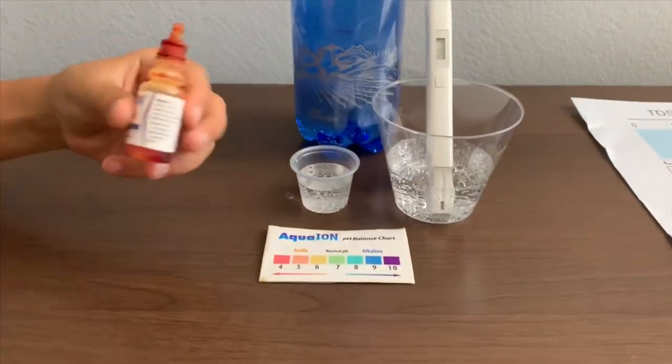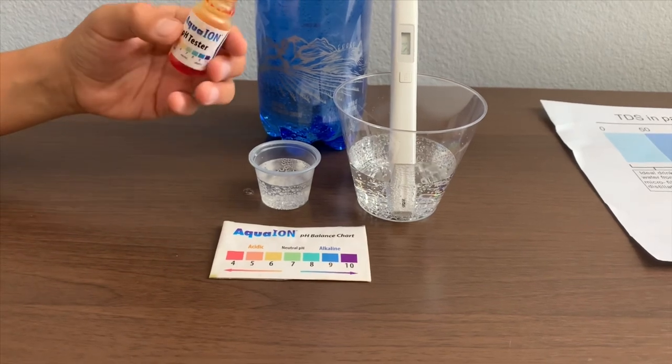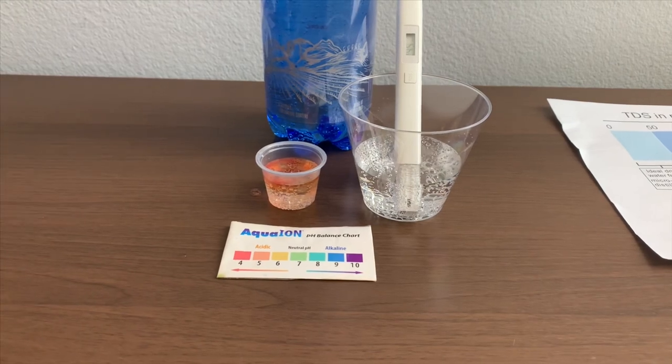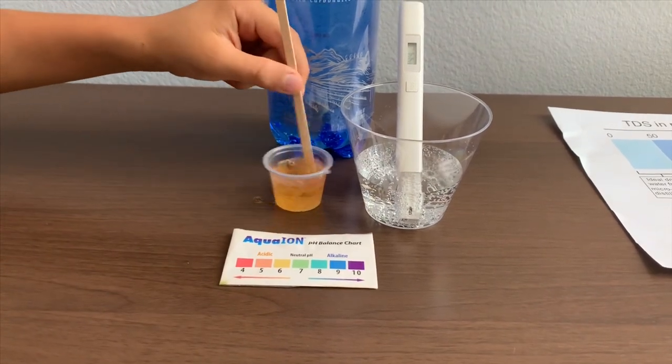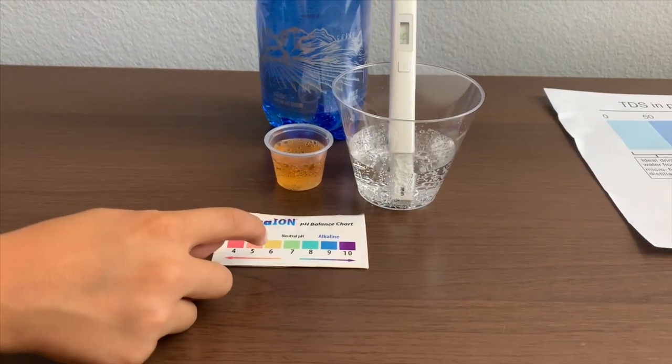Now let's test the pH level. If you want to buy this pH tester, check the link down below. Only do two drops. Let's stir it a little for a better result. I give this a six — this is acidic.